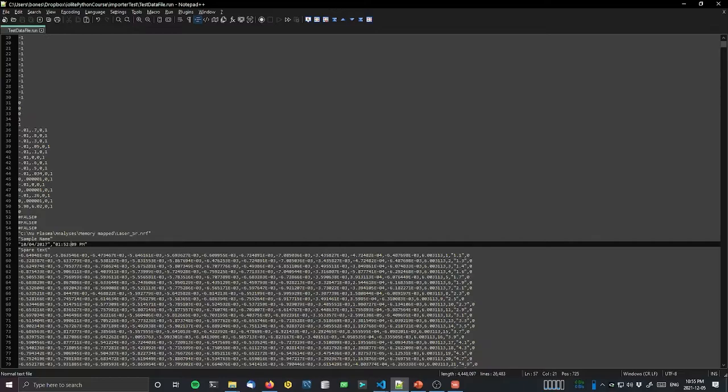And if you have large gaps between your files, that might not be such a problem. But if you have small gaps between your files and you can only place them within 1 minute of one another, then you might get file overlap issues. In this case, we have a decent timestamp.